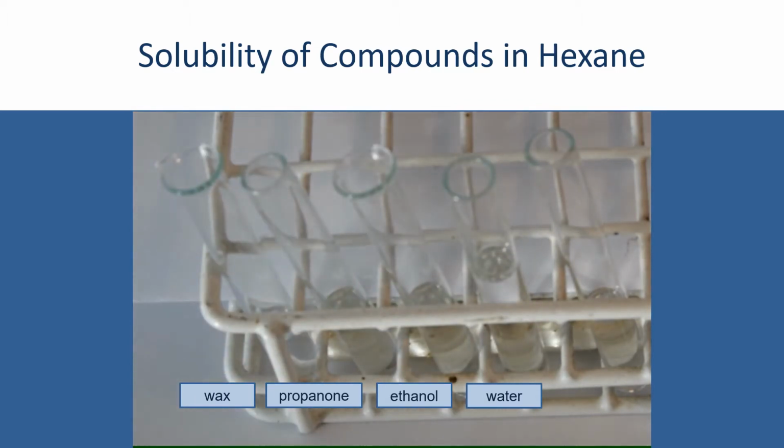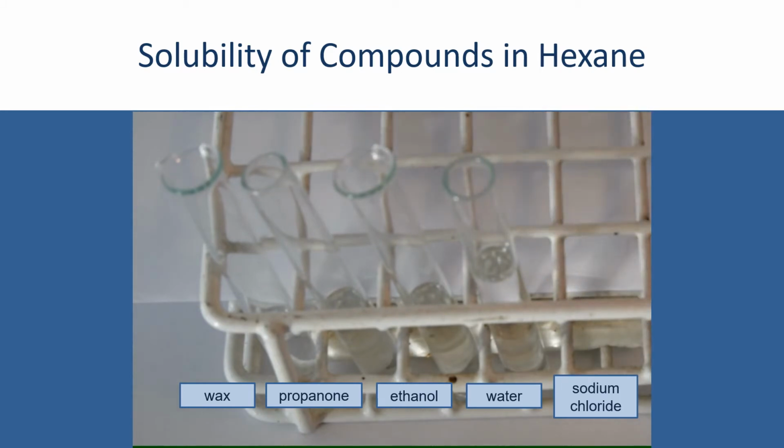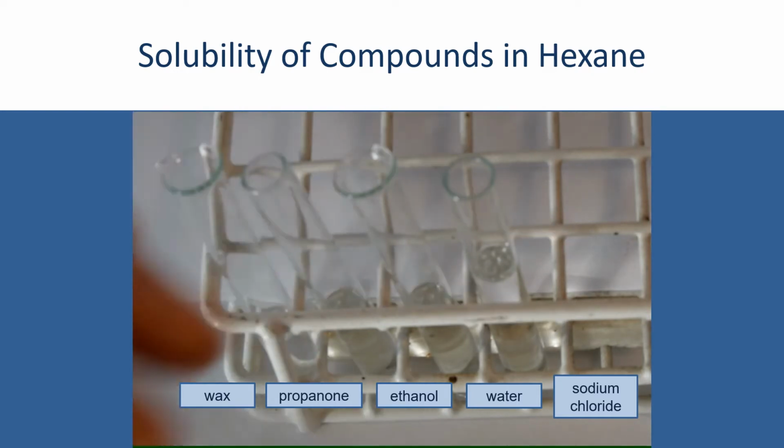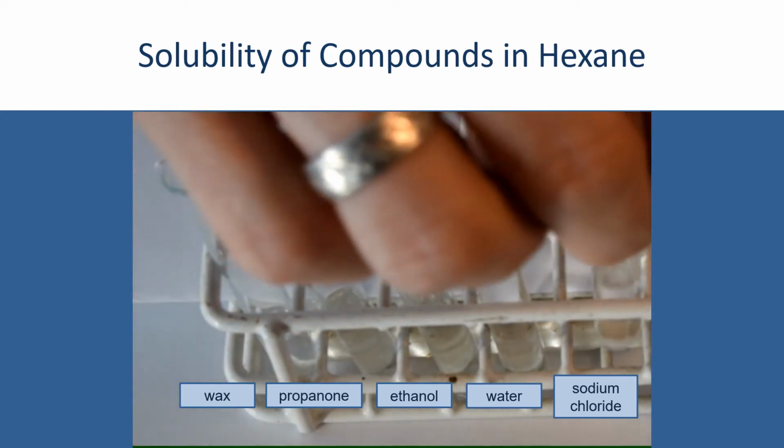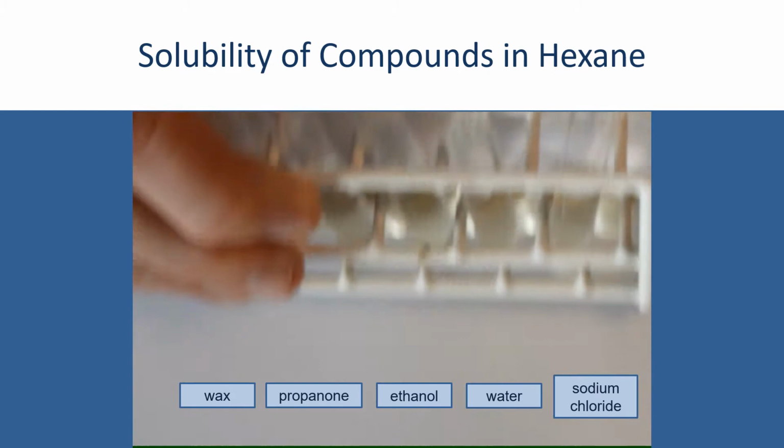And finally, I'm going to add some sodium chloride, an ionic solid, to the hexane. I'll give that a little shake. We'll have a look at them all in turn now and see what we can see.